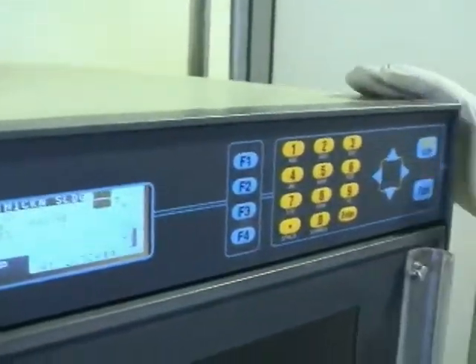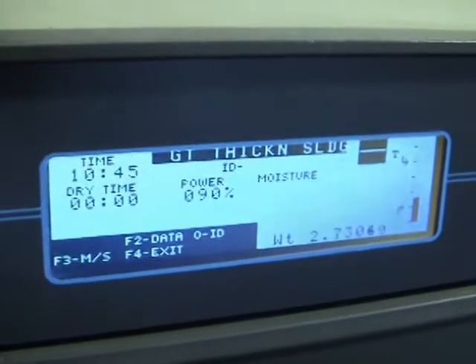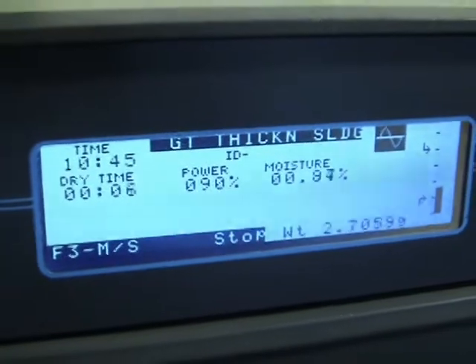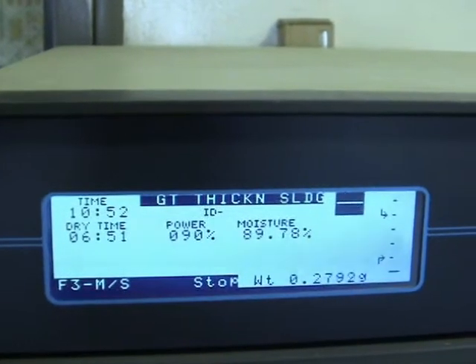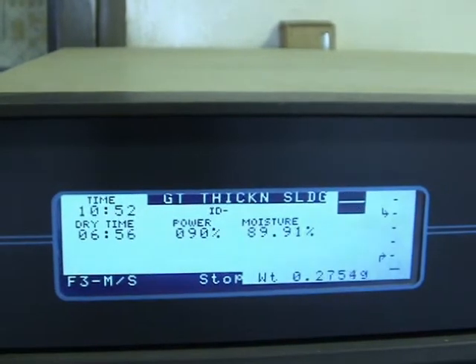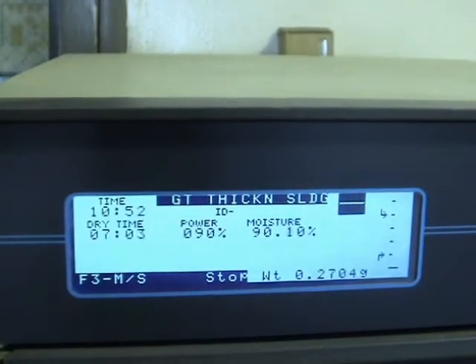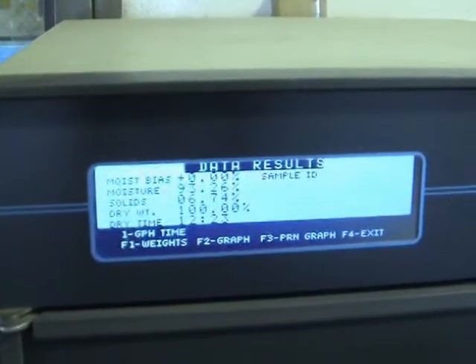The pre-installed programs differ in the percent power, duration of cycle, and amount of sample used in the analysis. Typically, the higher the moisture content of the sample, the longer it will take to evaporate the water from the sample. Results for total solids using the microwave technique can be had within 7 to 10 minutes.